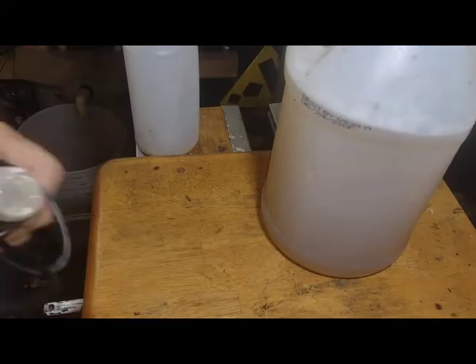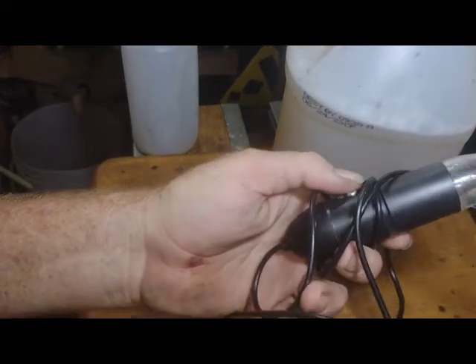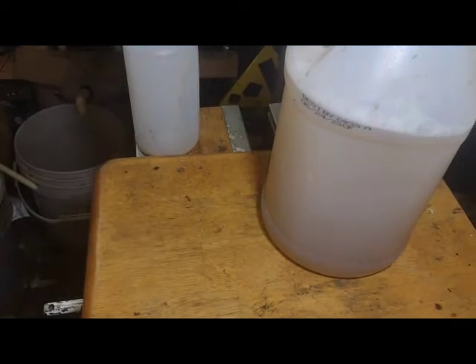We're going to take an up-close look at the effect using this microscope here. That should be an interesting one.